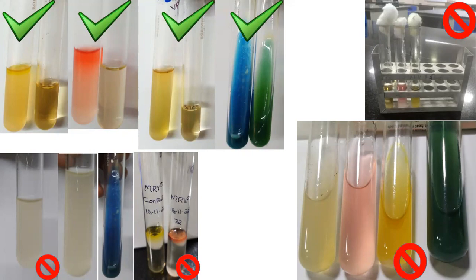Why go for my strain? Because it is isolated from the agricultural lab, it has been obtained as an endophytic bacteria from a leaf. No, go for it. Go for IMViC. When you are documenting the results of the IMViC, make sure you have an uninoculated control with all the tests. This is the way to document the IMViC. This is not the way to document the IMViC. Nothing is wrong with their results, but they do not have a control here.